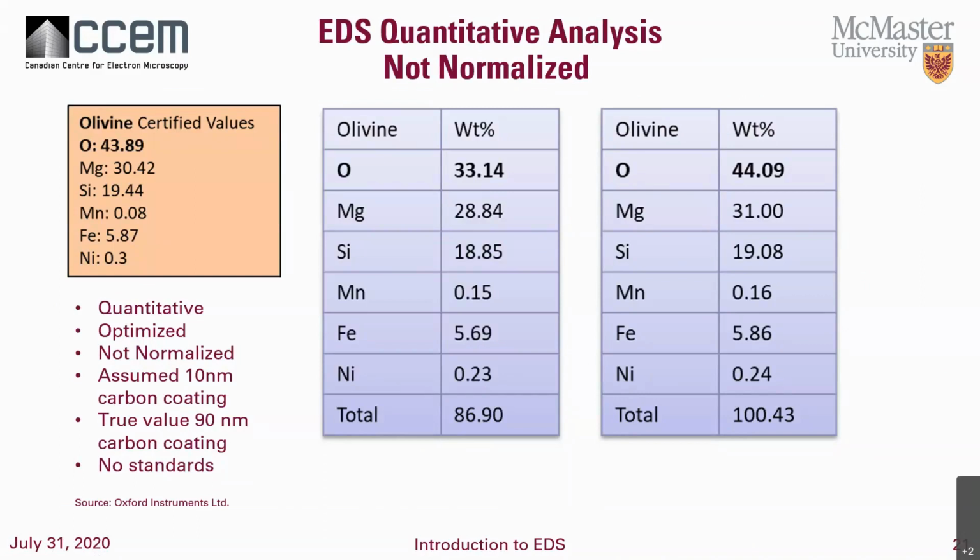Usually, we use a calibration element. For the calibration of the spectrometer itself, companies usually use manganese. I quite often use cobalt. In the case of optimization, it's usually an element that's convenient to use. So depending on the energy range, we'll use things like copper tape or a piece of silicon wafer for that. Why I'm showing this is you can see that we're not adding up to exactly 100% here for the quantification. Also, we're running into an absorption problem here.